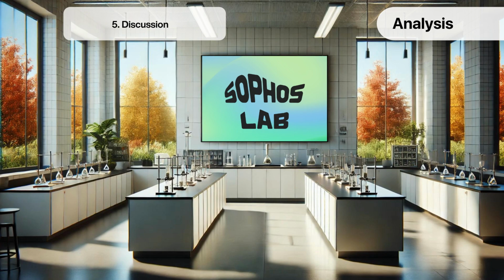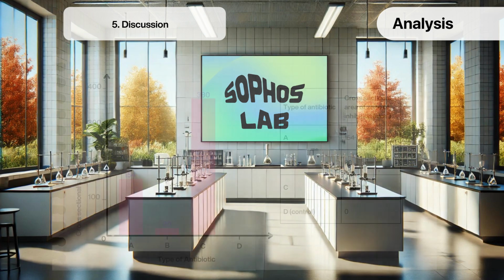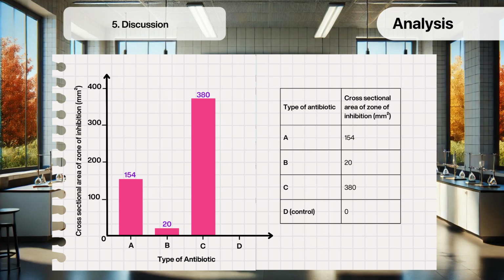Finally, discuss the results, noting which antibiotics or disinfectants were most effective and why. Consider biological mechanisms, such as the mode of action of each antibacterial agent. In our example, antibiotic C has the biggest zone of inhibition, therefore it is the most effective. Antibiotic B has the smallest zone of inhibition, therefore is the least effective because it killed less of the bacteria on the agar plate.